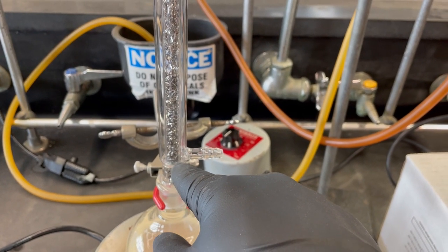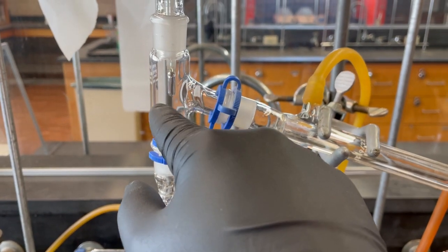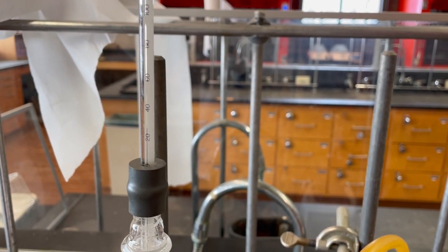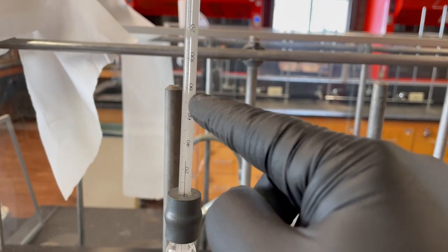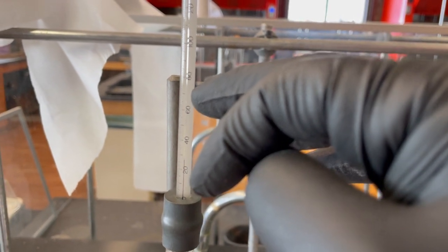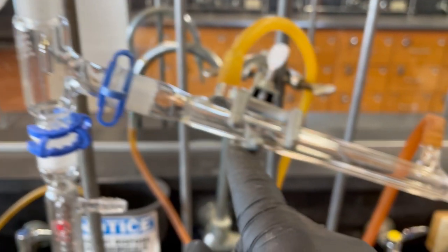Then it's going to heat back up, condense to a liquid, heat back up, condense to a liquid, over and over again, until some of it gets pushed up into here, at which point I will see a boiling point temperature, or at least a fixed temperature. So I'll see this go up, up, up until it gets in this region, right? And then it'll stay fixed. Once that stays fixed, that's when I want to start paying attention and really make sure that I'm noting what temperature it's at when I collect my fractions.